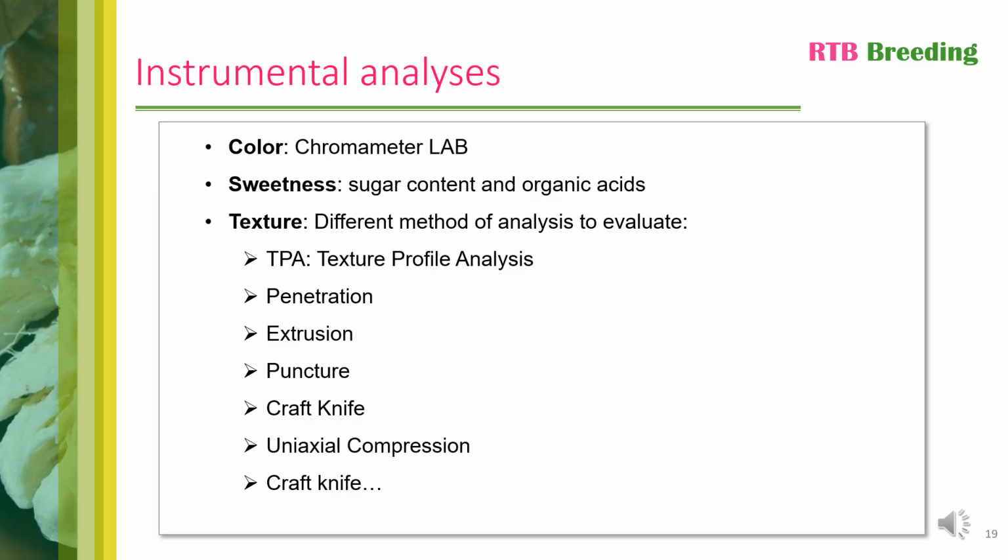What's important when calculating acceptability thresholds is to know which instrumental analysis method measures which sensory descriptor. If we want to be able to link instrumental and sensory analysis, we need to ensure that they measure the same sensory descriptor.